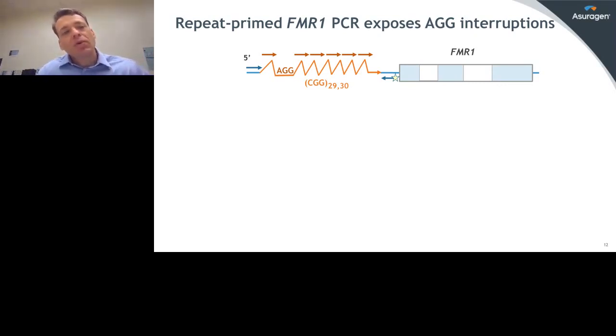So I gave you the example earlier that if you have a repeat that's in the mid-range of a premutation, plus or minus 2 CGGs can create a 20% differential risk. Well, if you take that same mid-range premutation allele and compare 2 AGGs versus 0 AGGs, the 2 AGG sample will be less than 10% risk, and the 0 AGG sample will be more than 70% risk. So you can see as much as a 10-fold difference as a function of AGG for a given CGG length.